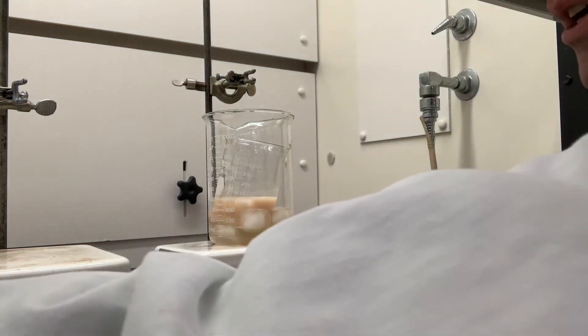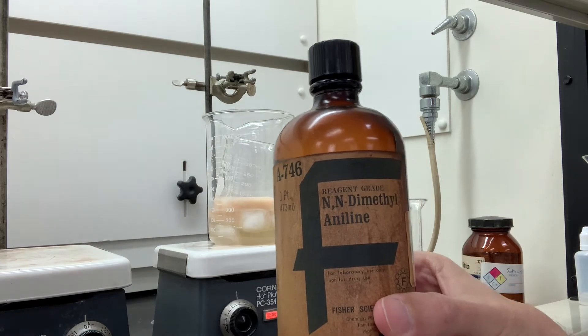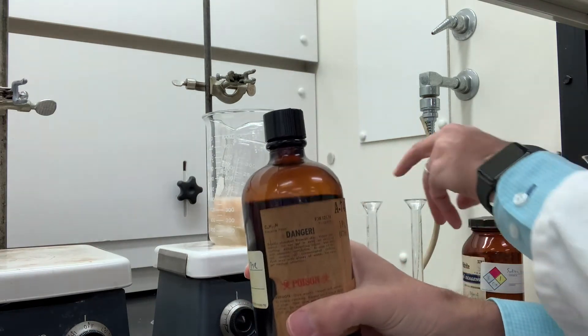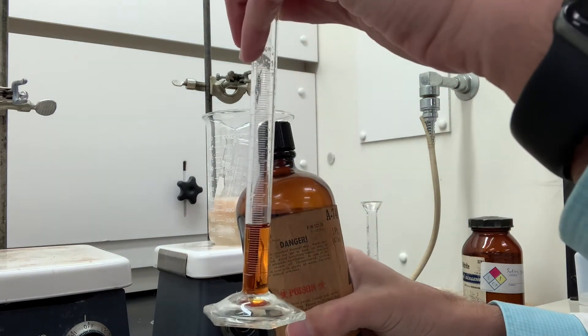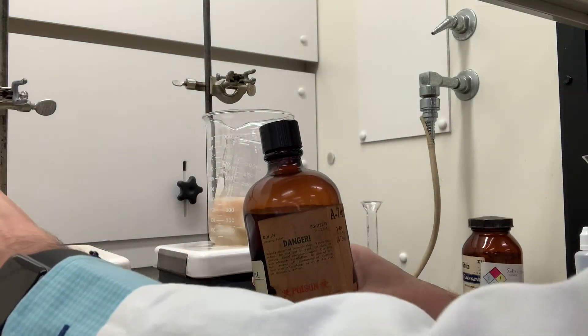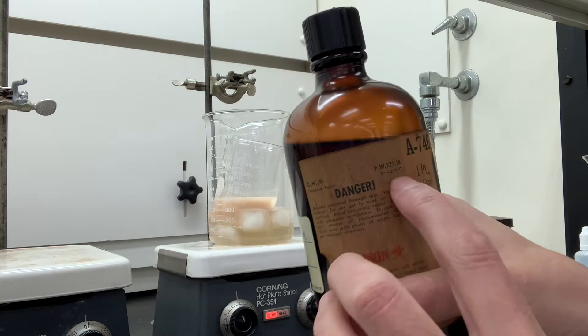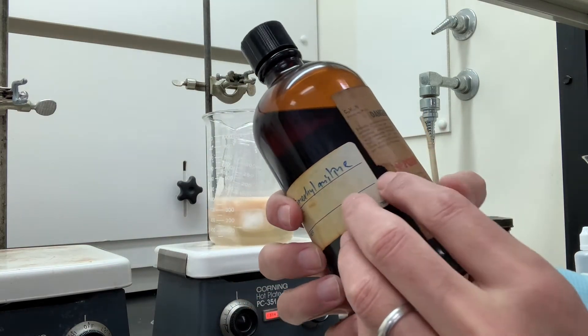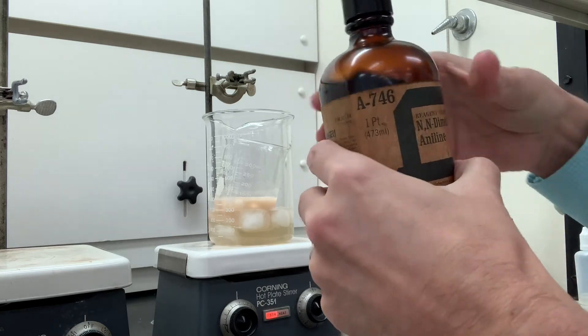Here's the information for dimethyl aniline. It's supposed to be a clear, colorless liquid, but there are some impurities in here that give this kind of light color. Here's its formula weight, its melting point, and the density is not on this bottle here.